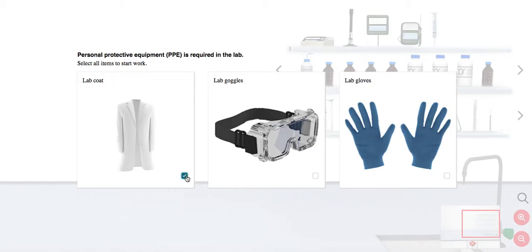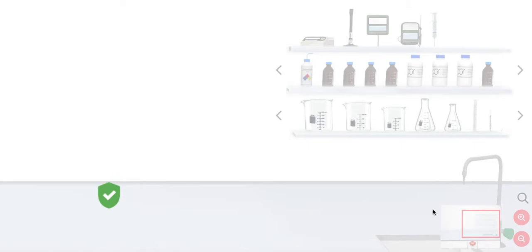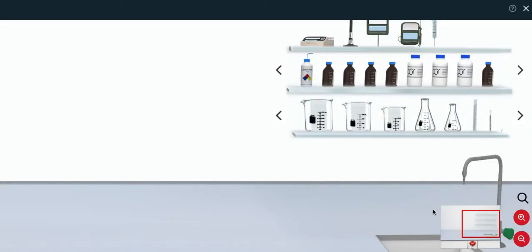Students must mark each checkbox to acknowledge and confirm that they are wearing the appropriate PPE in order to begin the experiment.